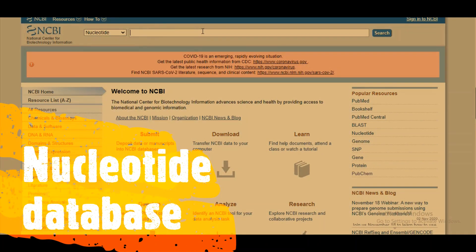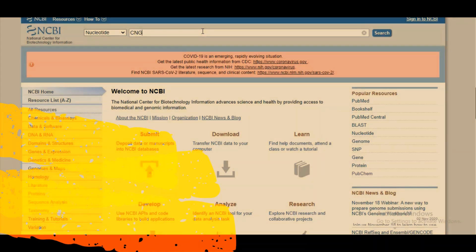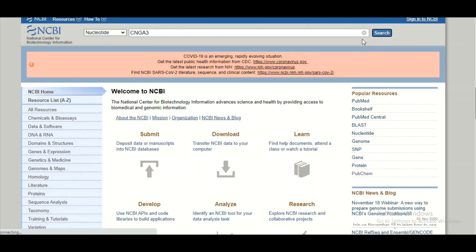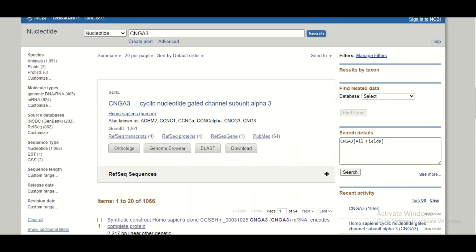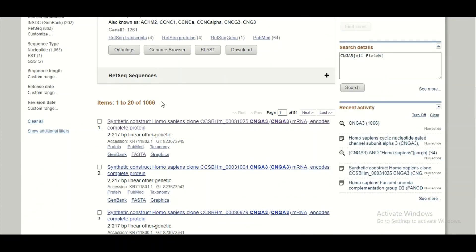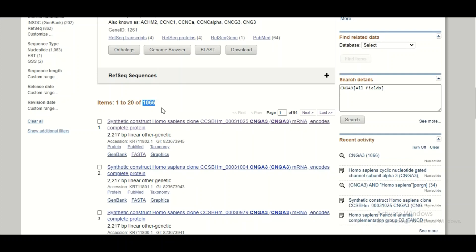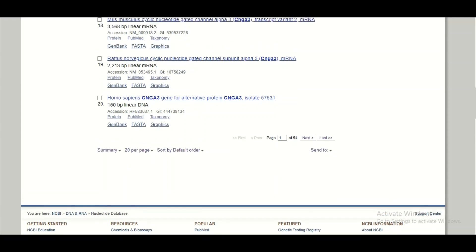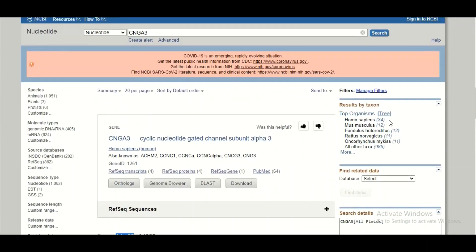We will click on Nucleotide and write our query in the search bar. Let's assume CNGA3 is the gene sequence I want to search. I will type CNGA3 and click the search button. The query is searched in the database and returns results — there are 1066 results related to my query, with 20 displayed on this page.